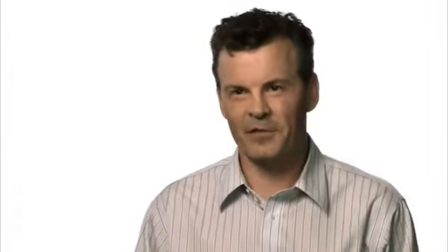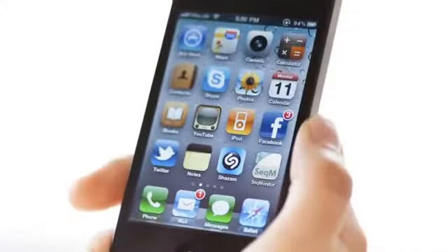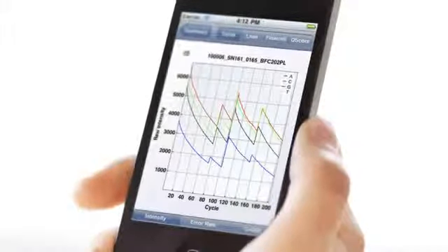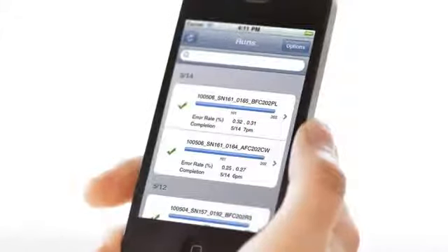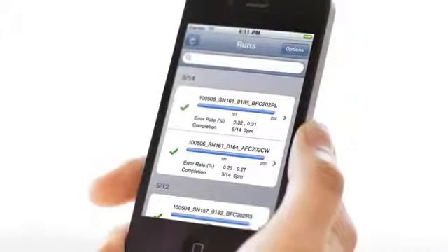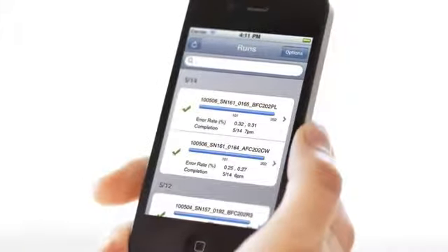After the first couple of runs, people won't want to be sitting in front of their instrument to see how things are going. Through SeqMonitor, you can assess performance of a run, see what your cluster densities are like, your estimated output, all the quality metrics that people would like to know about. You can assess that on any smartphone, iPad, or another computer—in another lab or down the road at Starbucks.